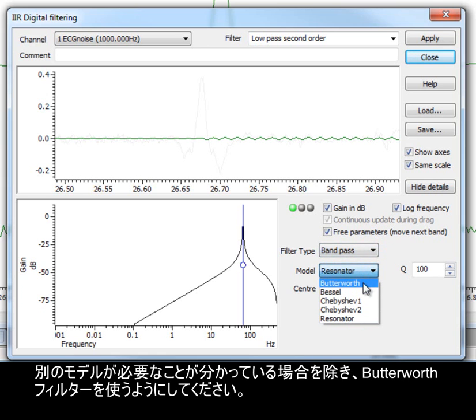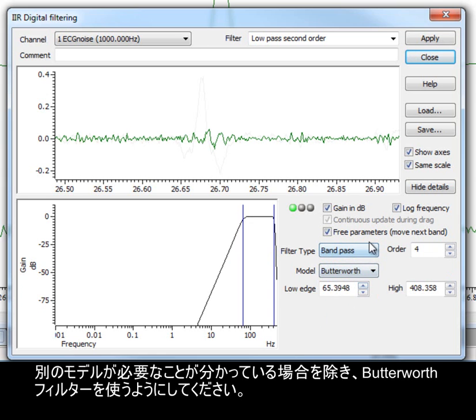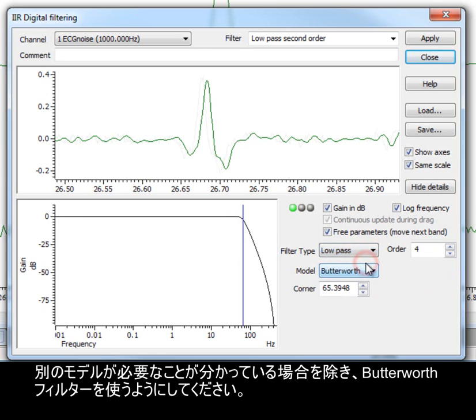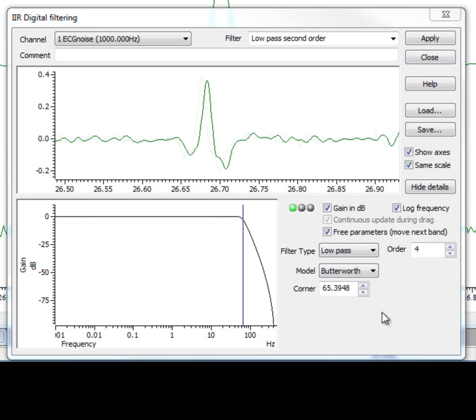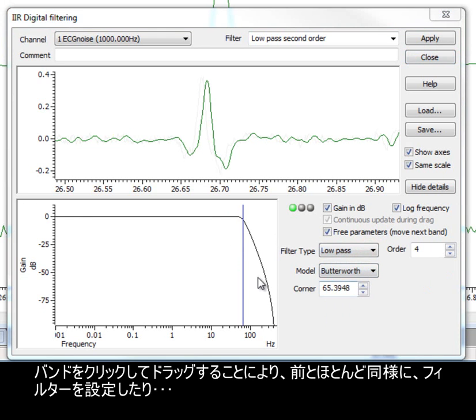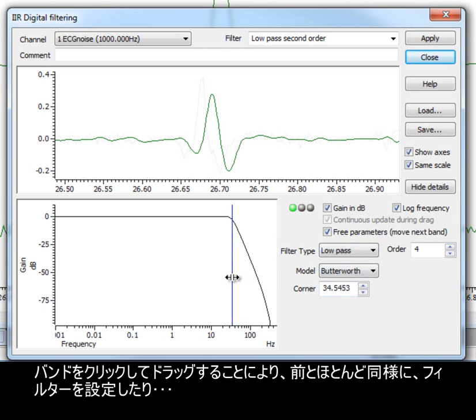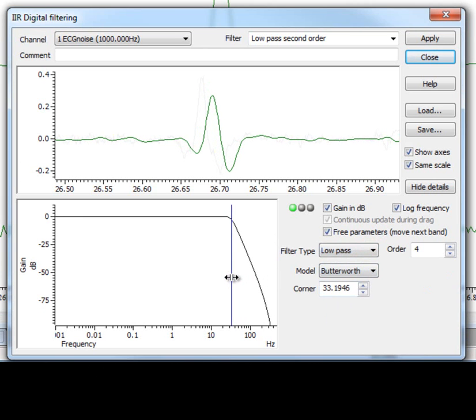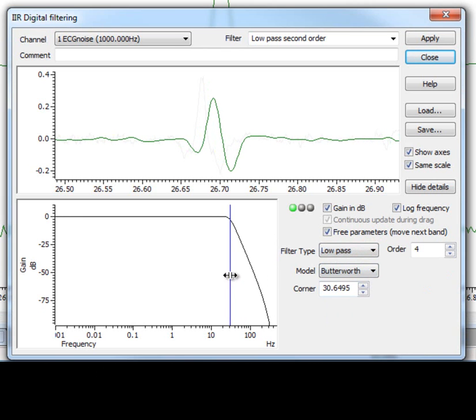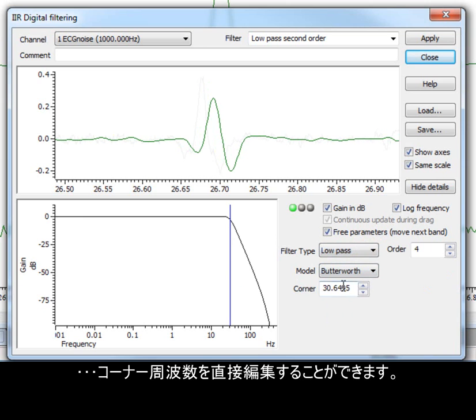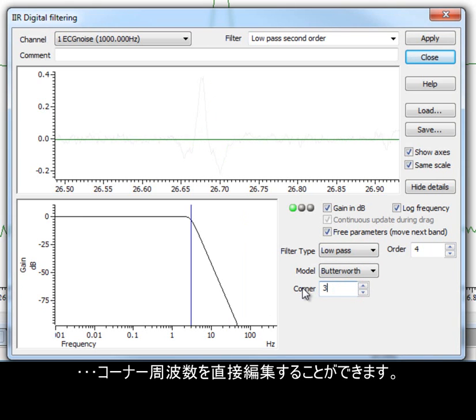Unless you know that you need a different model, you should use a Butterworth filter. By clicking and dragging the bands, we can set up our filter much like before, or edit the corner frequency directly.